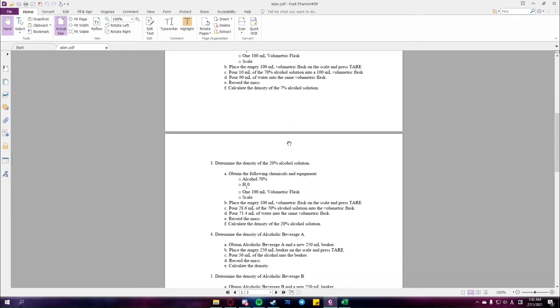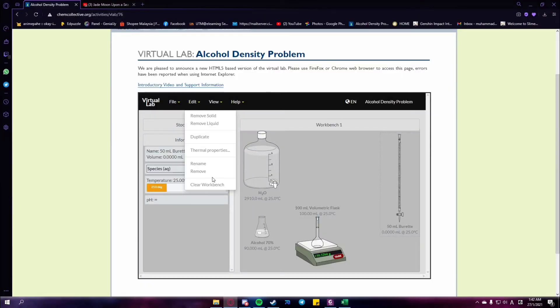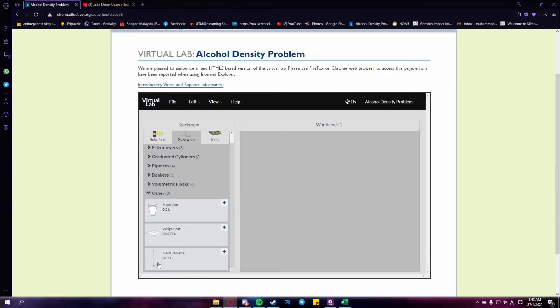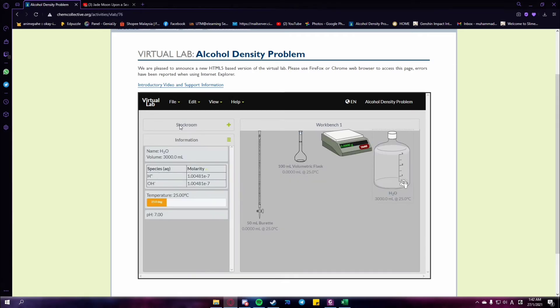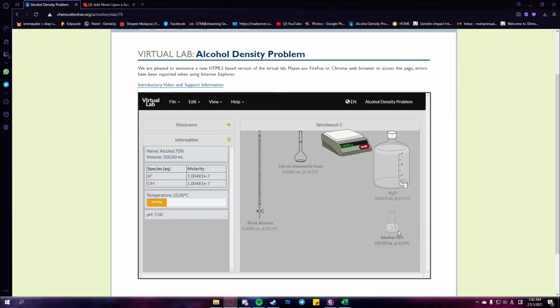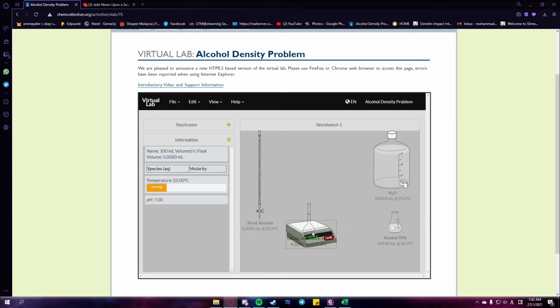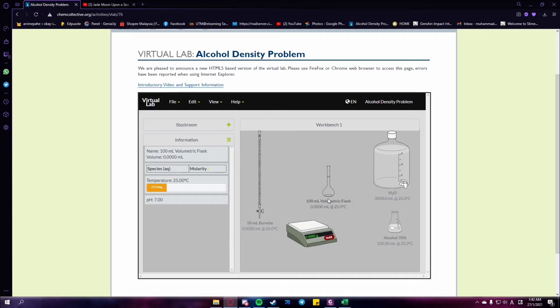Let's move on to procedure 3, which is to determine the density of the 20% alcohol solution. In this procedure, we use the same equipment and chemicals as in procedure 2: 70% alcohol, water, a 100 ml volumetric flask, and a scale. As usual, the first step is to record the mass of the empty volumetric flask.